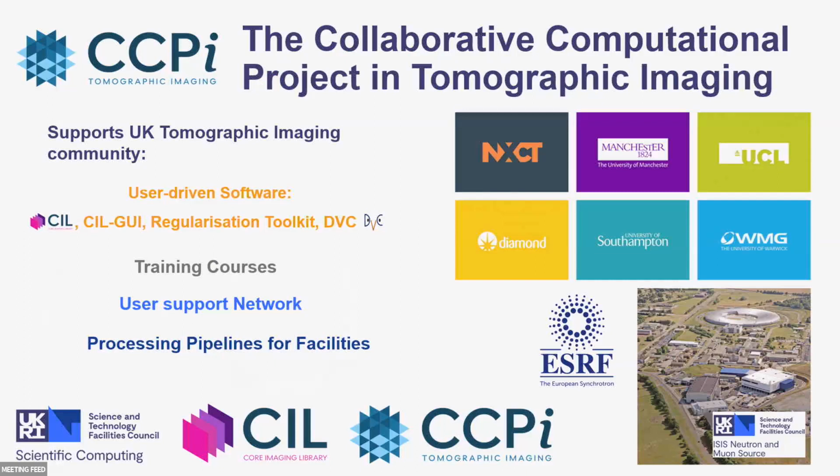We're also developing a graphical user interface for CIL and provide a regularization toolkit and also software for digital volume correlation, which is an analysis technique for after reconstruction of your data. CCPI provides training courses, a user support network, and also we're working on the development of processing pipelines for facilities, such as those pictured here.